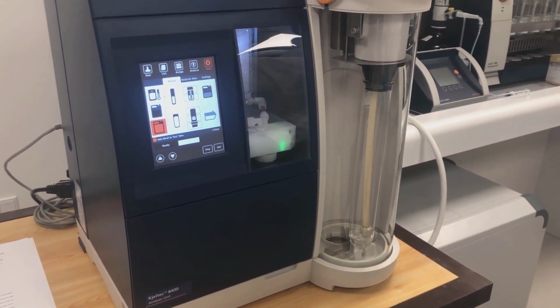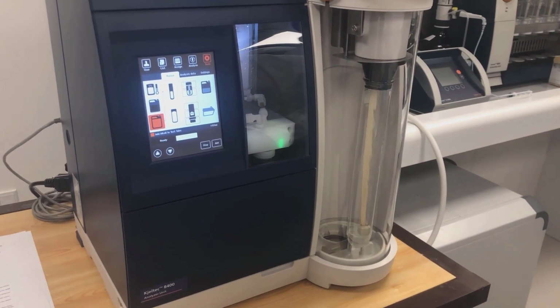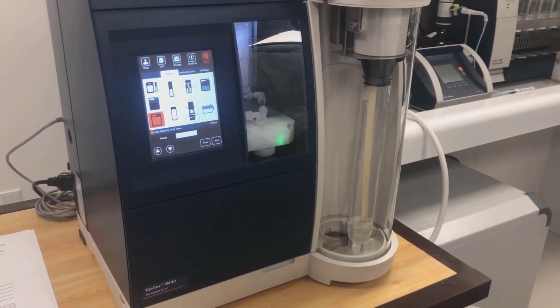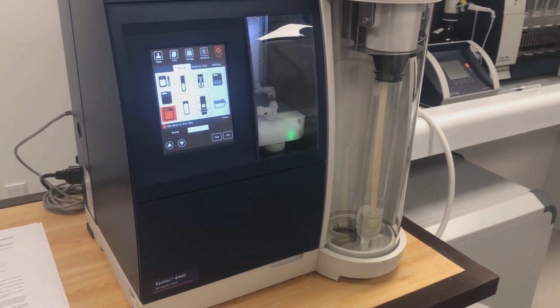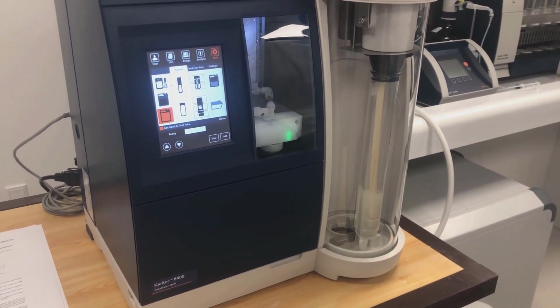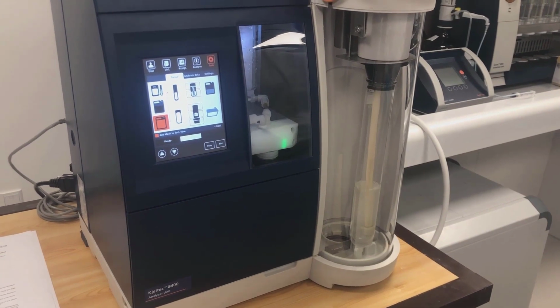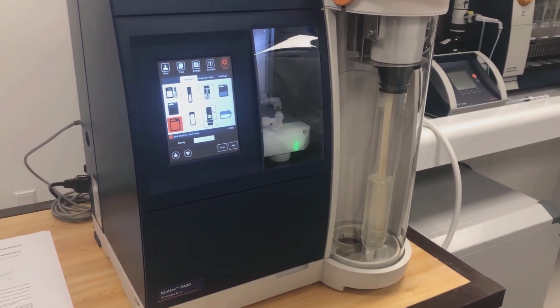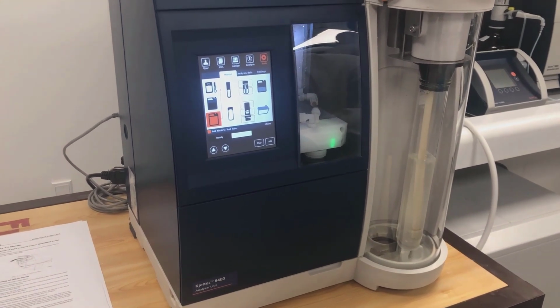Now you can see no reagent is added because the tubing is still empty, and then the water is coming. You have to repeat this several times. This is reflushing the ALKALI pump to remove the crystals inside.